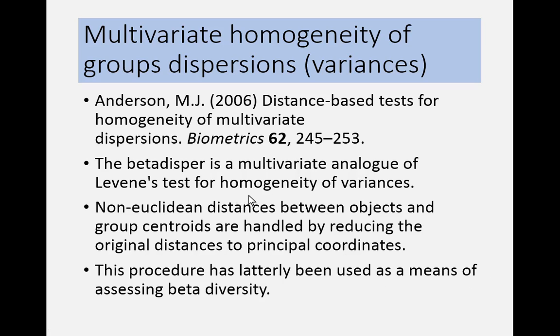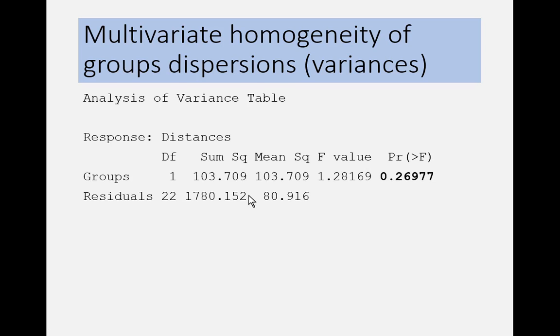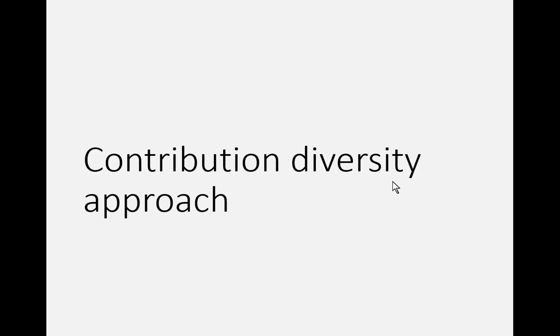And there's again the publication. And it again spits out a p-value here, which is even larger than from the two previous tests, telling you that the difference is not statistically significant. So these are the three statistical tests on top of the ordination analysis.